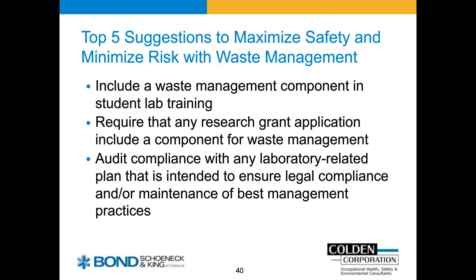And again, this is another great opportunity for collaboration, dealing with the people in the lab and the EHS staff, in terms of how do we handle this? Because I know at the end of the day I'm going to have X amount of materials, and you get some sort of ballpark in terms of how much it's going to cost to go off-site. And maybe you talk, and maybe I should use some different materials. I can get the same end game, and I can minimize the cost, minimize the risk.